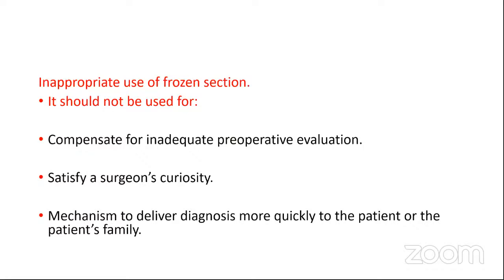If we have a breast mass or lung mass, and this mass is accessible by core biopsy or FNA, we have to make the diagnosis beforehand, before we start the surgery. We don't keep making the diagnosis on the frozen section, because we can save the patient's time and a lot of health problems that could happen during the long period of the operation.